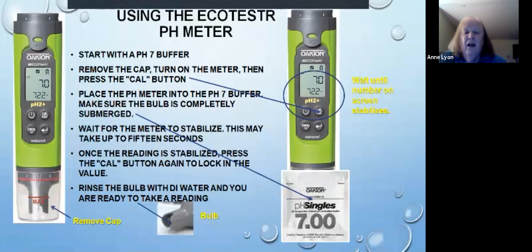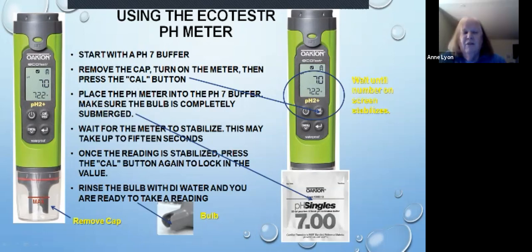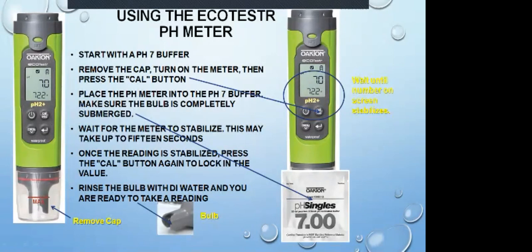And I'd like you to try to keep those Eco Testers vertical in your bags. I've got some safety pins and some elastic. I know it sounds kind of simple, but you'll be able to use that little loop to keep your Eco Tester standing up vertically in between sampling one month to another.